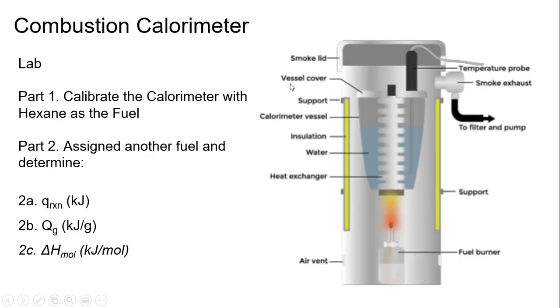So here's a picture, a very bad picture, but a picture of a combustion calorimeter. This is from your PDF. You have the fuel that's going to go here, and it's separate from the water. And the reaction is going to go off, it's going to occur, and then the heat will transfer to the water. There's a temperature probe, and you would be able to collect the temperature from this reaction.